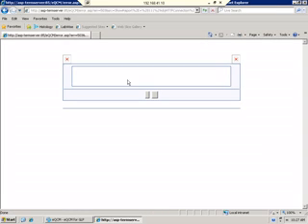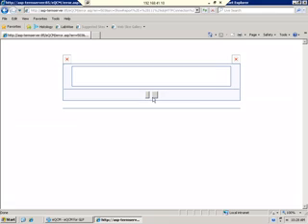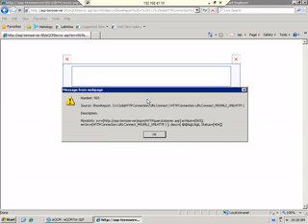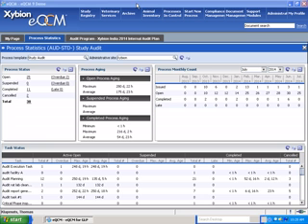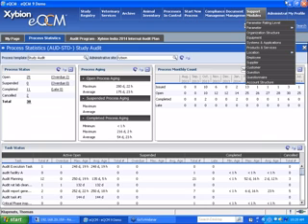But if I just wanted to click answer, what it's going to do is open the questionnaire. Let me just show you.